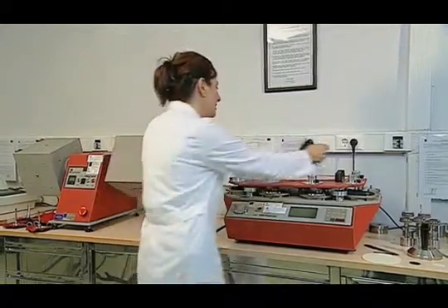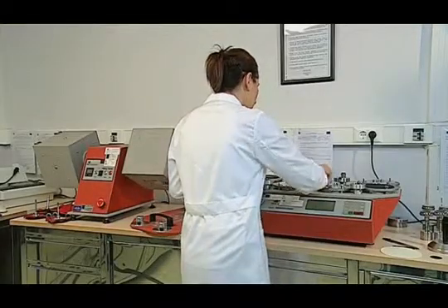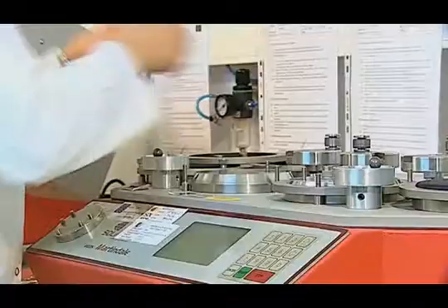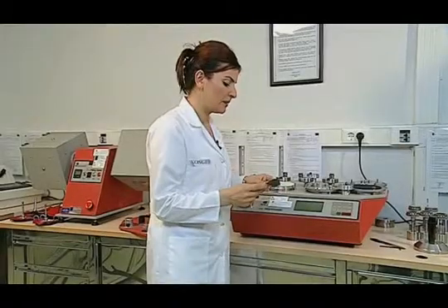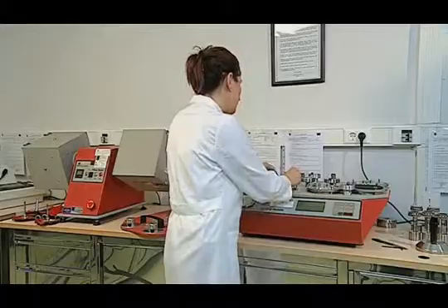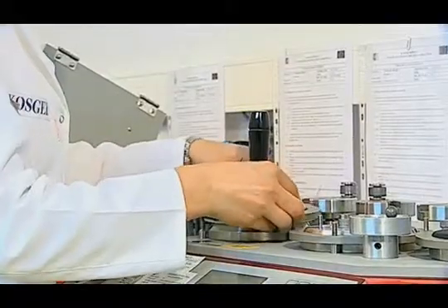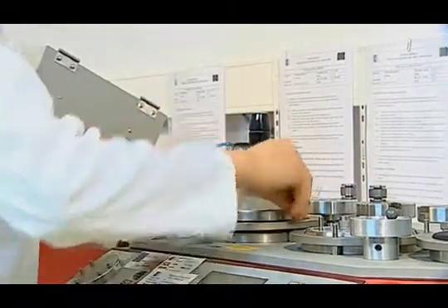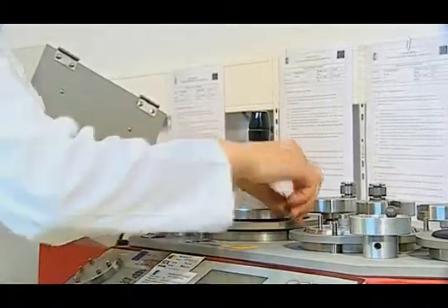140mm wide samples are placed on the abrasion table. The sample holder manual of the device is removed from the device. The collar of the table is removed and a 140mm diameter felt is attached to the surface of the table. After placing the sample on the felt with its front side facing up, the presser foot is placed on it and attached to the table with a collar. Four specimens are placed in this way.